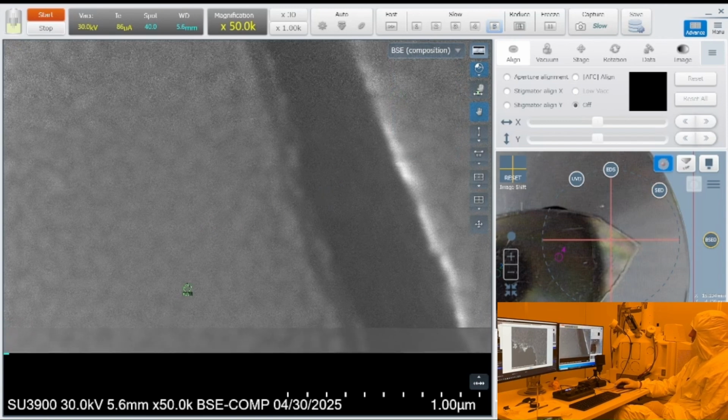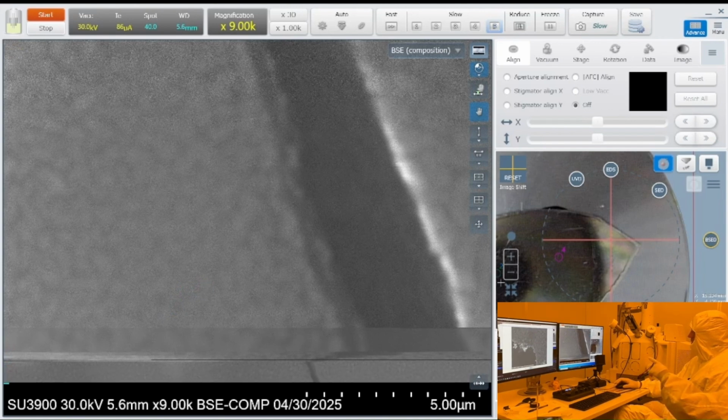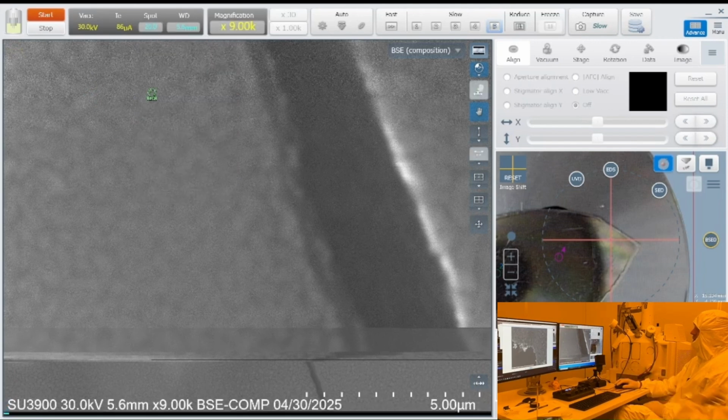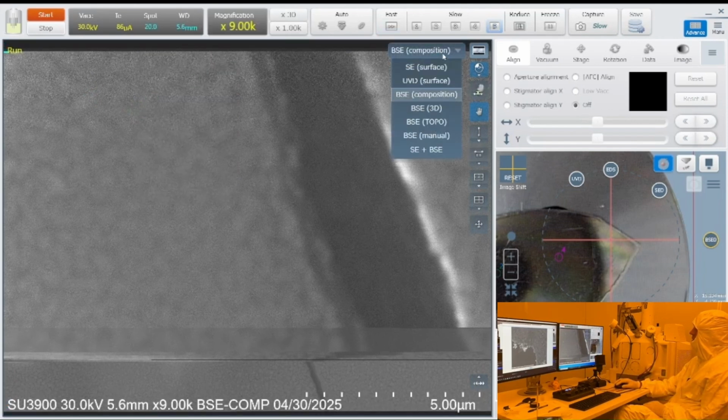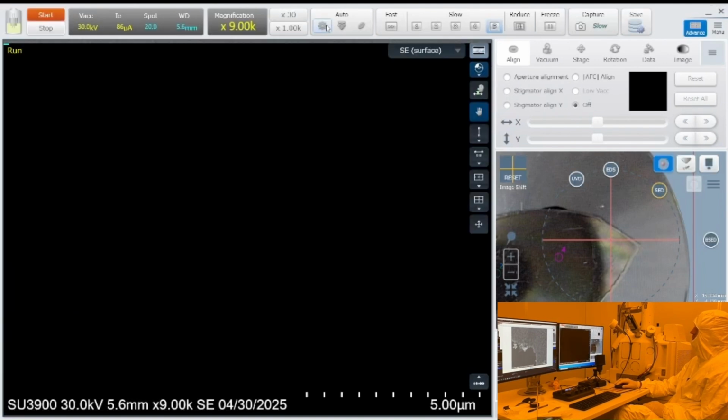So we want to put another sample in, then? We can probably try this at a smaller spot size just to compare this, once we get a decent image. Sure. Do you still want me to grab the PMSSQ film samples? No, we'll image just those ones. Okay.